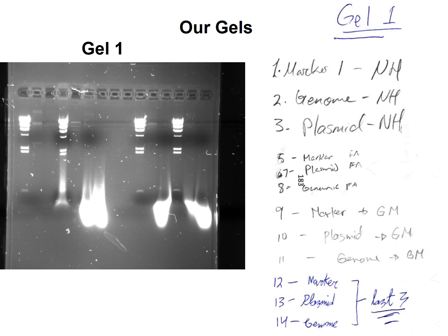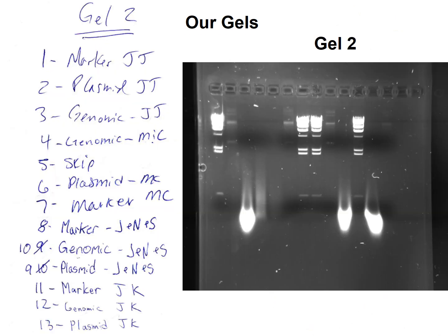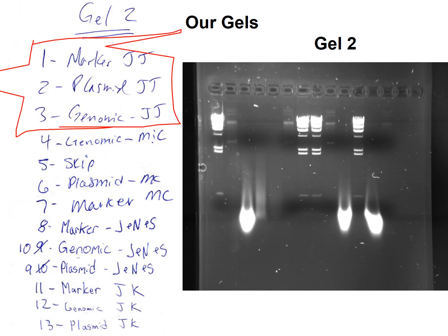So here's gel one — you can see all the labels over there. Gel two, the labels over there. So JJ, this is you. Jaylin and Jen, those are your samples — I loaded them. So one, two, and three: lane one, lane two, and lane three. Lane one is your molecular weight marker right here. Lane two is your plasmid — there's the plasmid right there. And lane three is the high molecular weight genomic DNA.